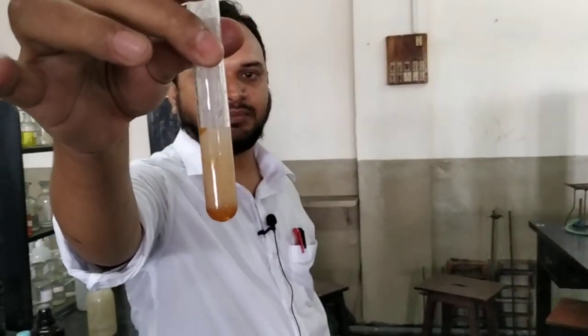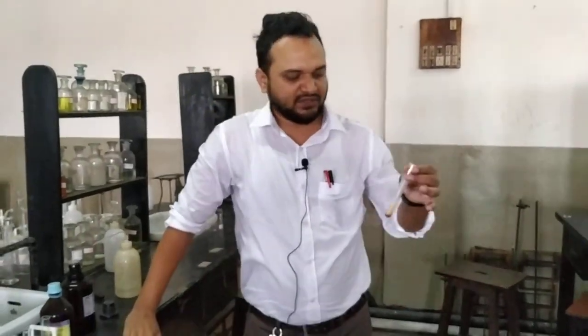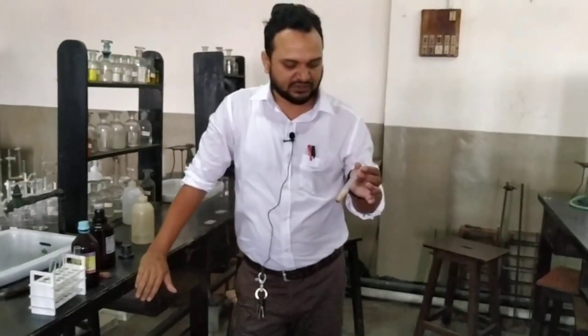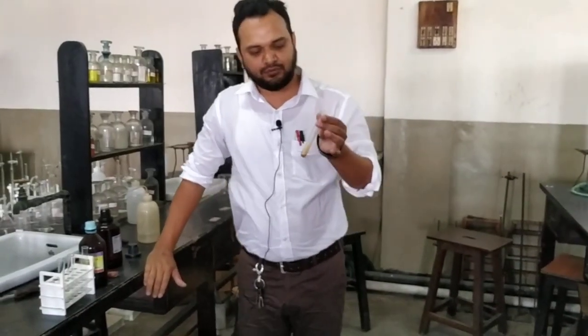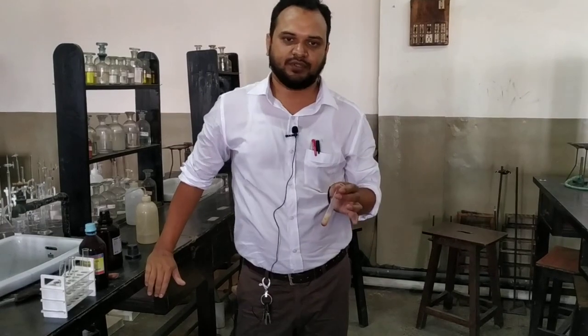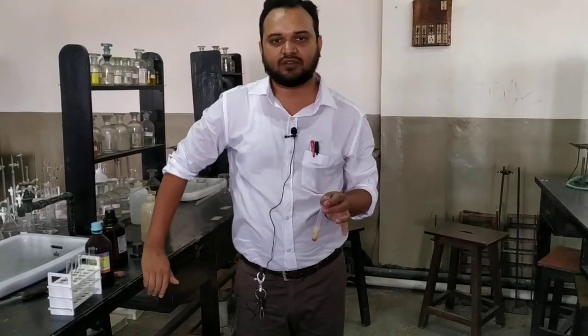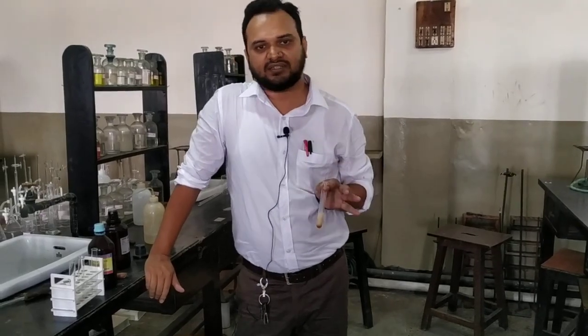So in your exam, this experiment will be given: add bromine water dropwise in excess amount to an aqueous suspension of aniline. The observation that you will write: a pinkish white precipitate is observed. So that is all about our aniline. The previous 4 tests are already given, and this one was the last and the 5th test.